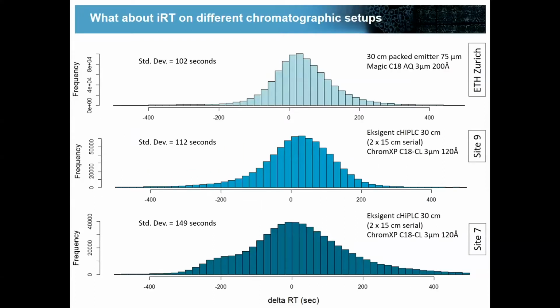What about retention time? These are now some retention time error plots for large sets of peptides detected in 3 data sets. Rudy, I think, mentioned earlier, that at one point we did a study where we sent out one set of samples to 11 different labs, and we asked them to analyze these in SWATH mode. And these are the retention time errors. From iRT we make a prediction of where the peptide should be in retention time space, and that should be at 0. Then when you actually detect it in the DIA analysis, maybe it's actually over here somewhere. So the delta between these is something we score in the software.